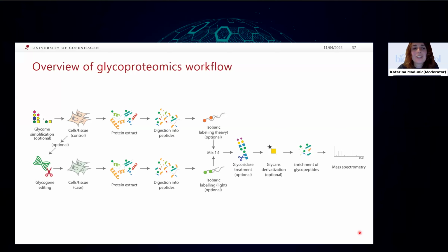Okay, yeah. So if you take out the glycome simplification step or glycogene editing, how long does it take to do this protocol in the lab, from the start with the cell or tissue step until mass spectrometry and data analysis?